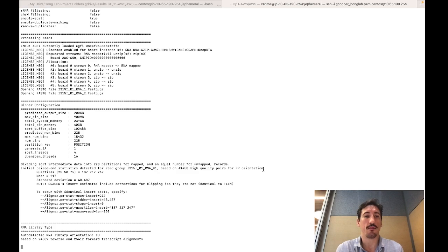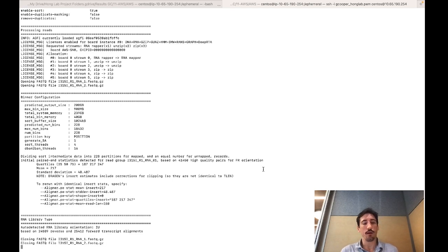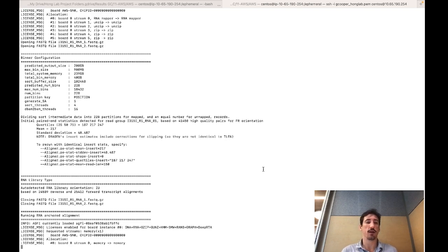Within our lab, we sometimes will be aligning, I don't know, 20 to 30 samples at a time. And so if that took 2 hours per sample, that can take days. And so this will take an analysis that would have taken days and do it in less than an hour. So I think that's really the benefit of DRAGEN alignment and quantification, as opposed to doing it more traditional routes by aligning with BWA and using Salmon itself as a quantifier here.